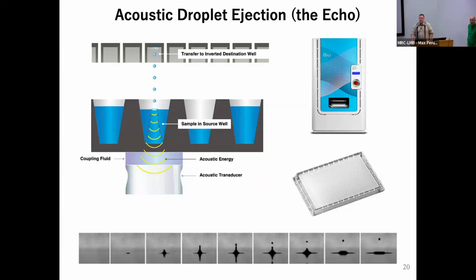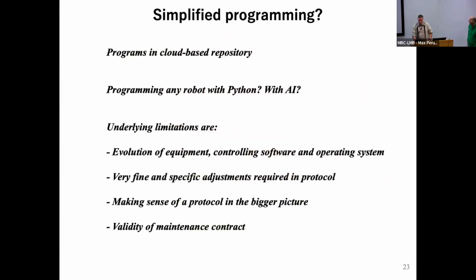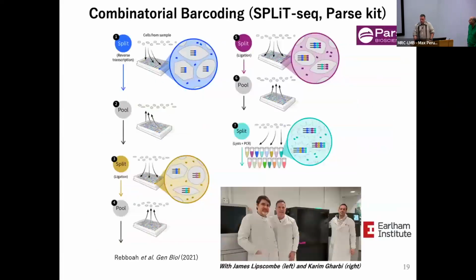For the sequencing applications, is there a magnetic block if you had bead cleanup? No, we're not there yet. So you're talking about this kind of application. No, I'm looking only into the pipetting for now. So one thing at a time.